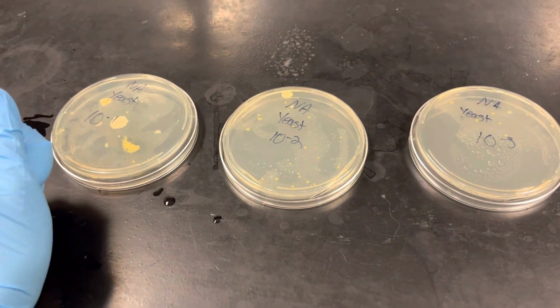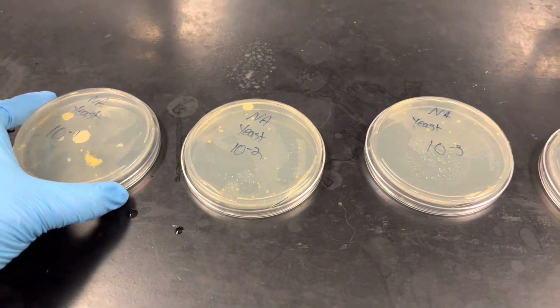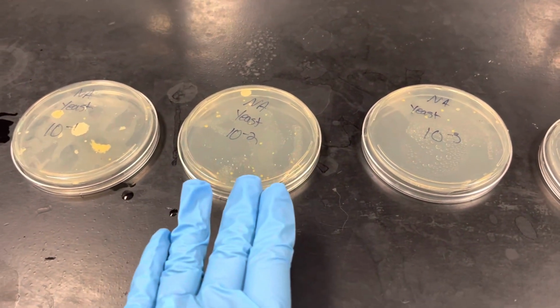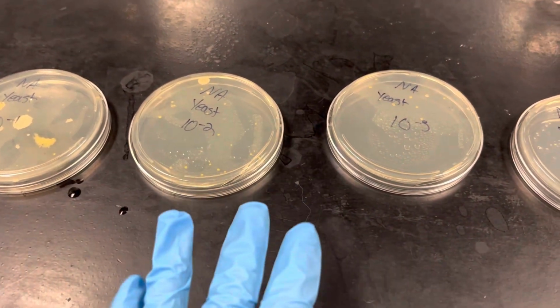So this video will show you what you should be counting for your dilution plates for lab. What is the yeast and what isn't? Because when I did the sample, I grew some bacteria colonies. They're the yellow ones along with the yeast. So it could be misleading if you don't know what you're counting.